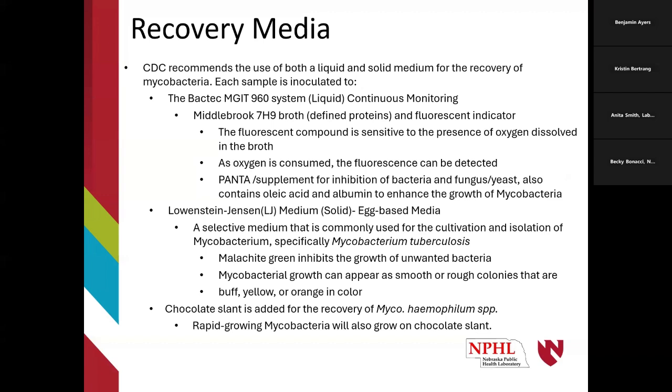And typically they will grow within 3 to 4 days on blood or chocolate plates, so always keep that in the back of your mind. When you're doing gram stains, they'll be very wispy, beaded rods. Another thing I always try to teach people is that when you put the organism onto saline when you're doing your gram stain, it'll float because of the high lipid content. So always keep that in mind if you ever run across that.